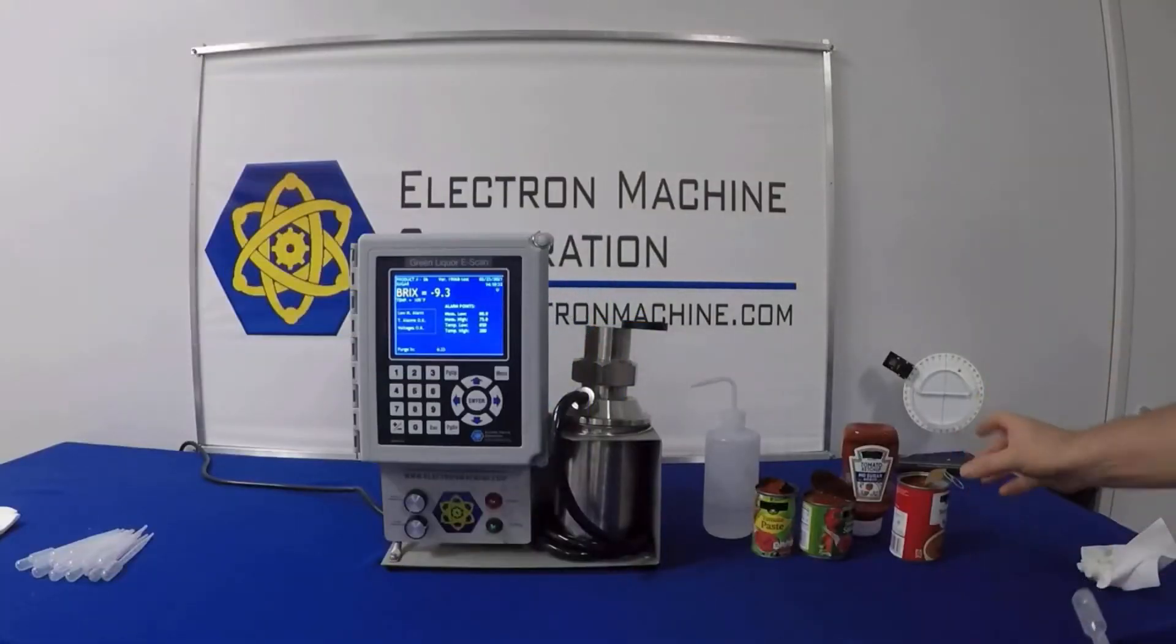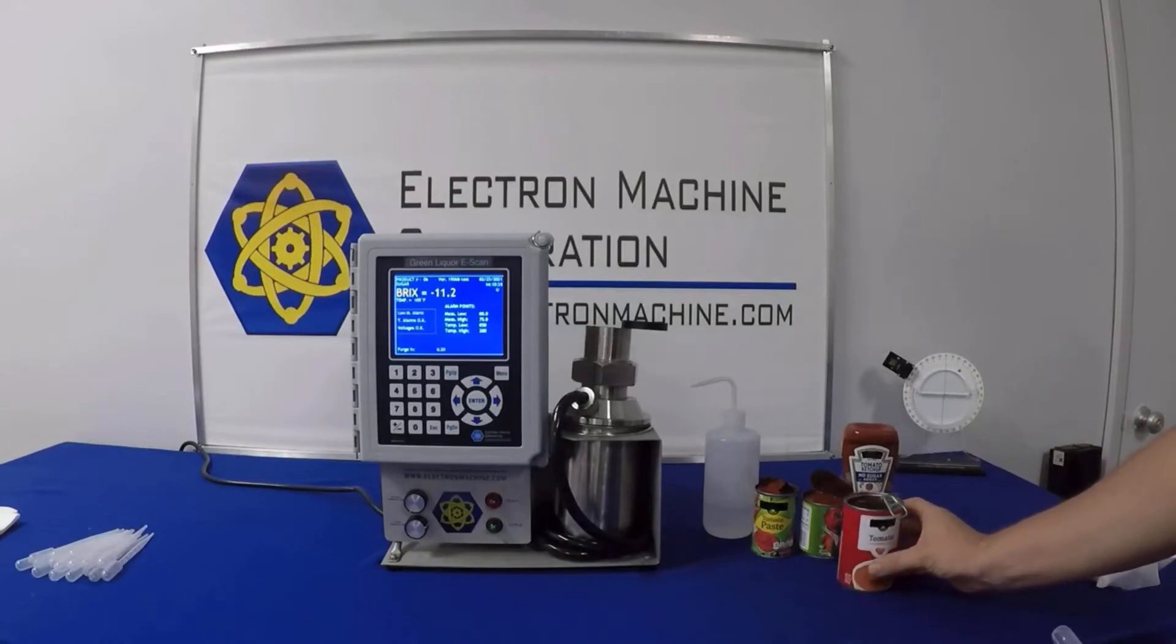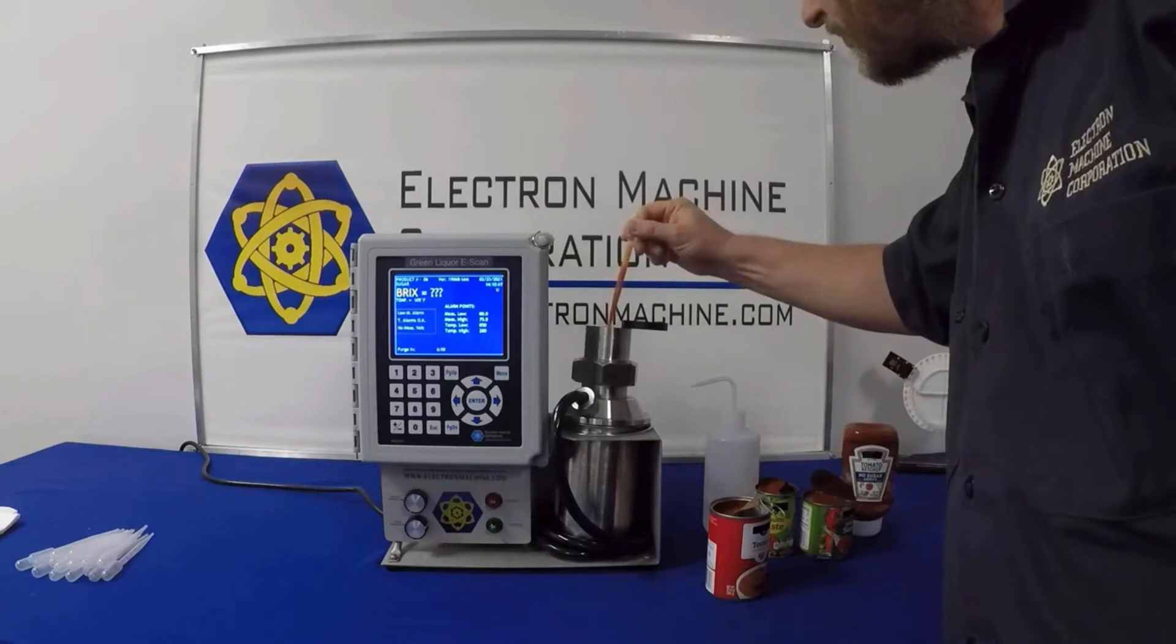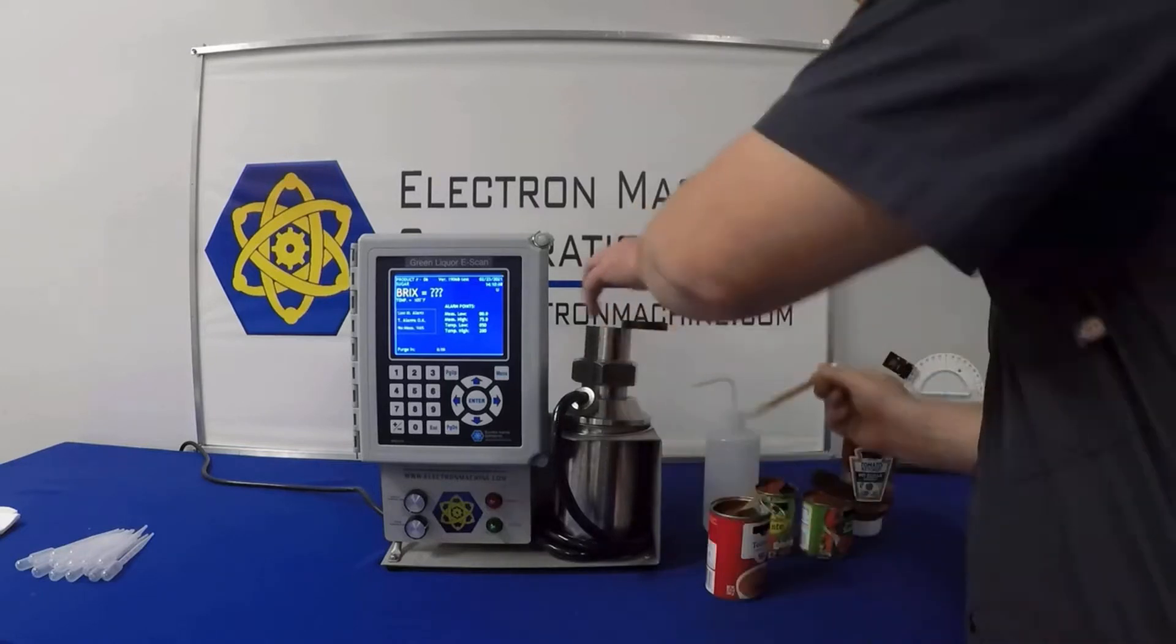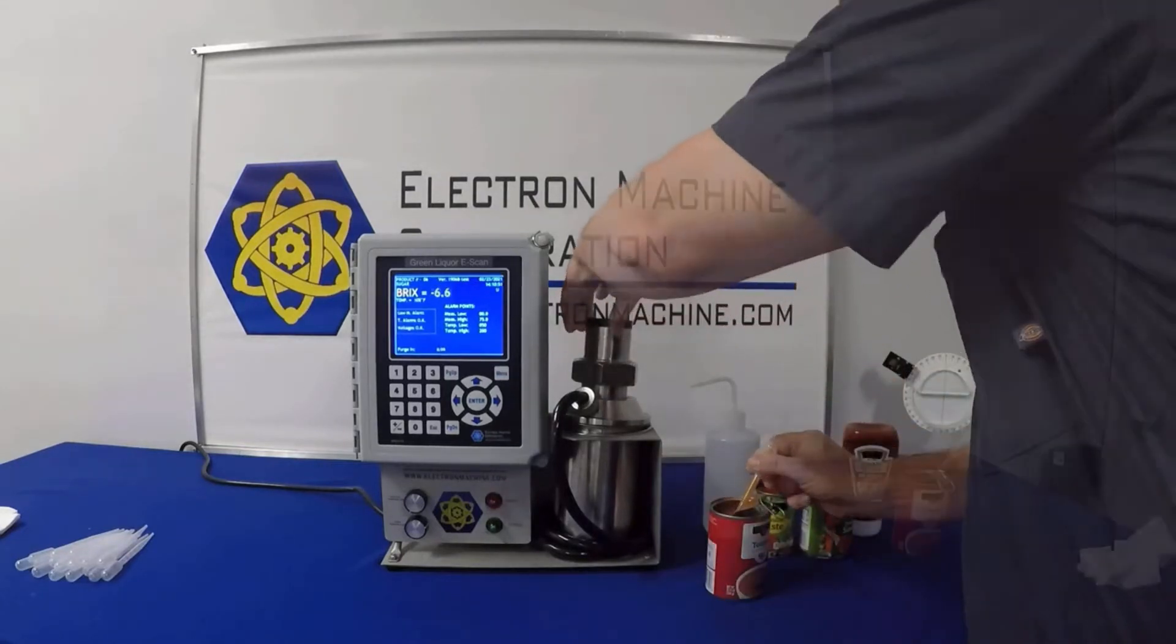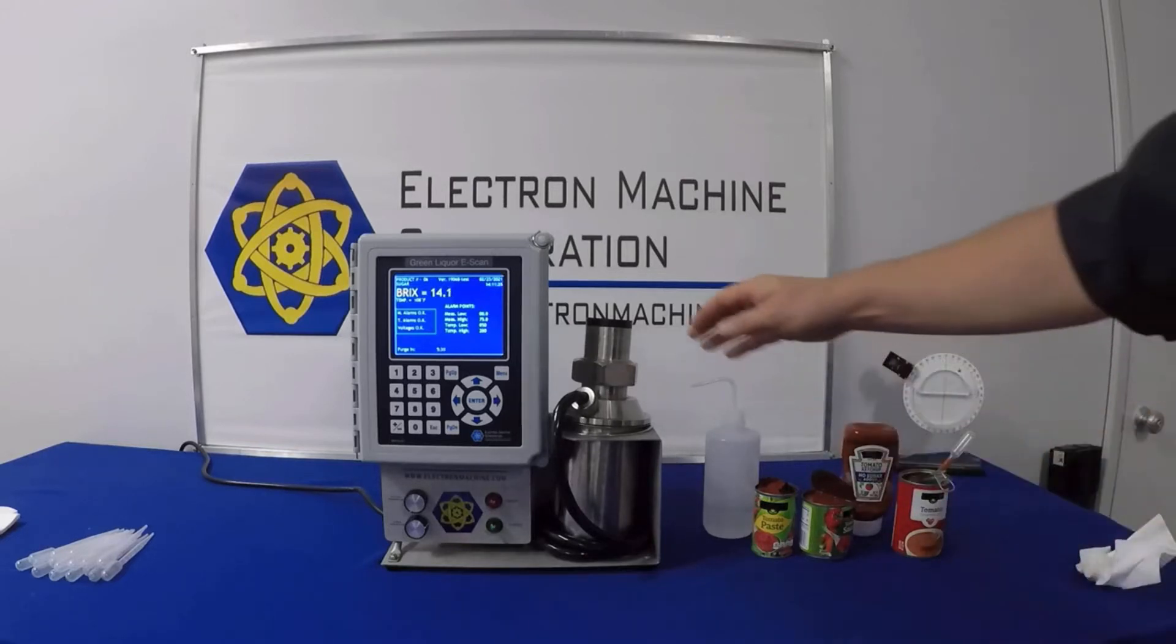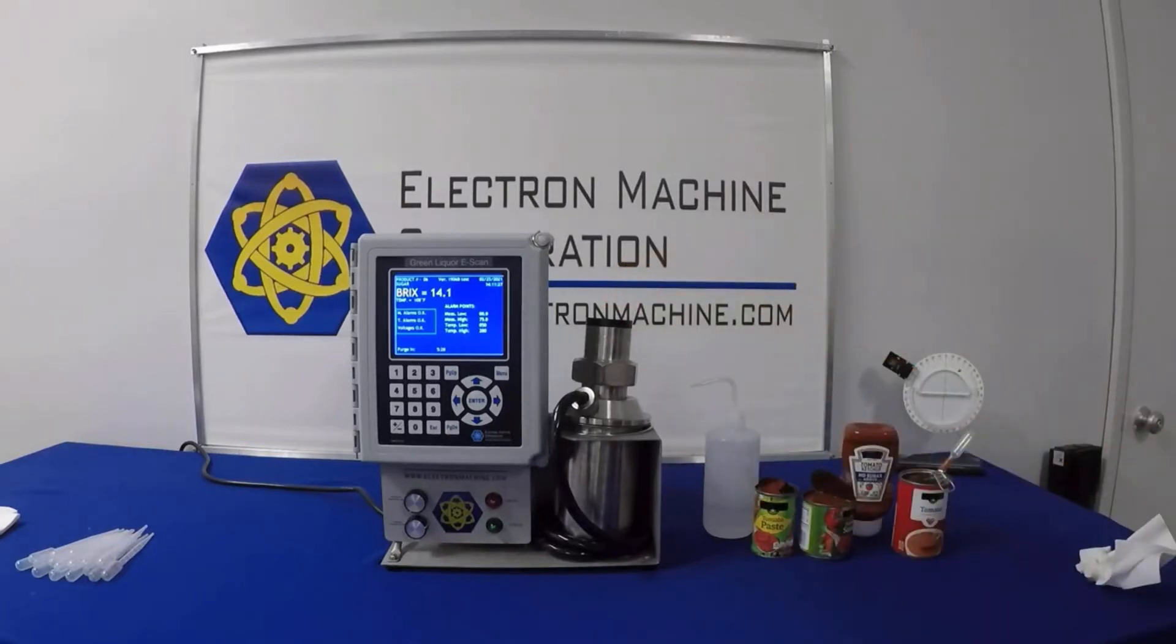For our first product, we're going to start with a tomato condensed soup. Brix readings for condensed soup are important because it allows you to evaporate the water out of the process by maintaining a consistent product. That way, when you combine your next can of water with the can of condensed soup, you get a similar taste and process.